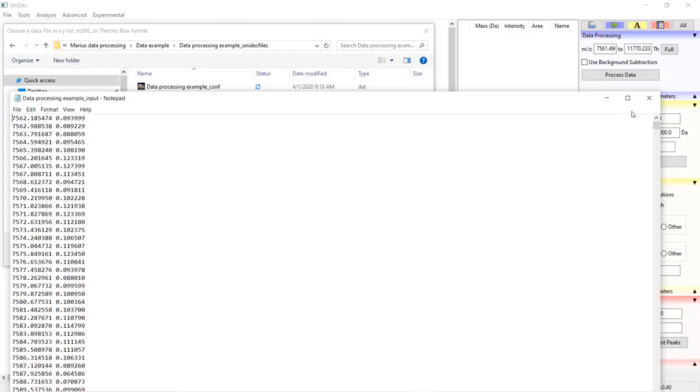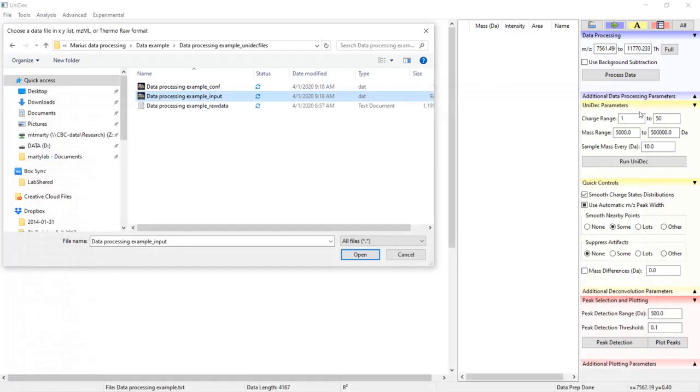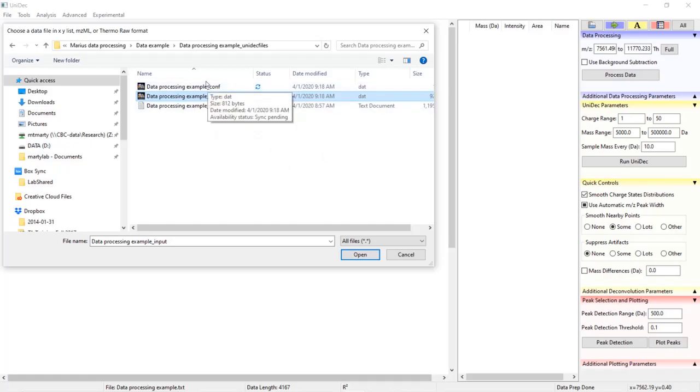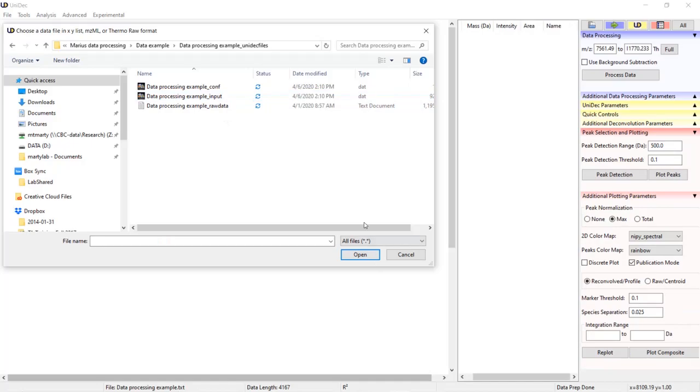Other files in the folder include a copy of the raw data and the config file that contains all of the parameters in UniDec set for this data. Let's exit out of the data folder.